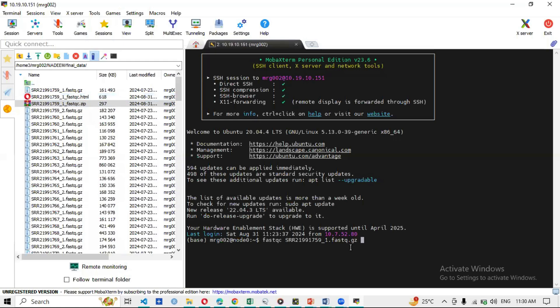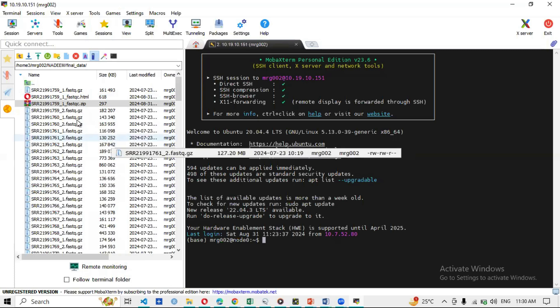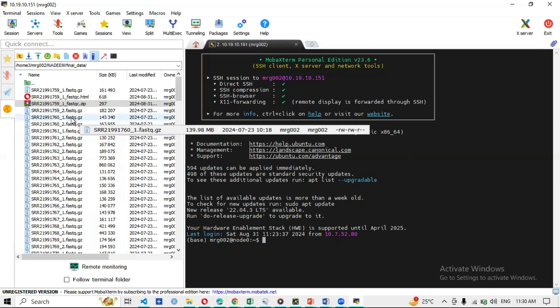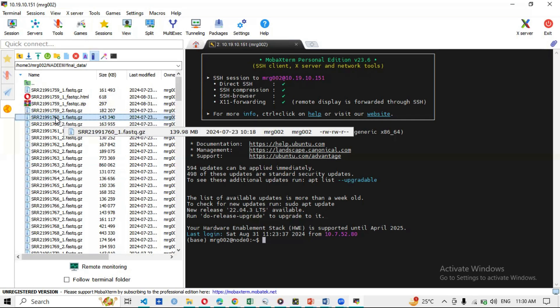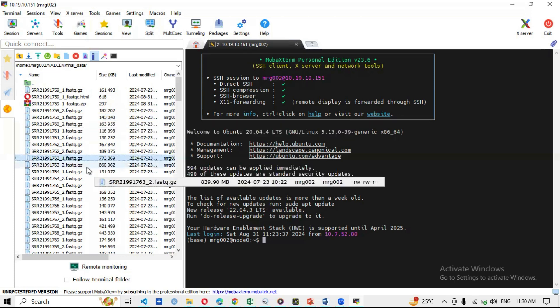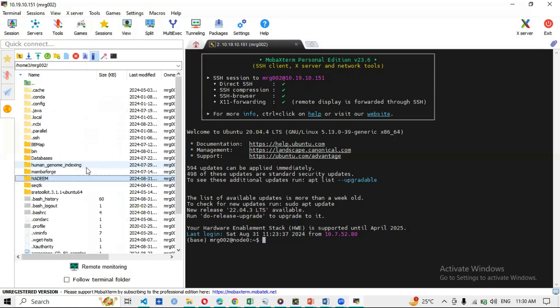Now, if you want to run FastQC on multiple files, it is very easy. You can use a single command or a script — I prefer a script because we will be using scripts extensively in later parts of the series. A script is simply a '.sh' file. Inside it you write your commands, and for multiple files you apply a for loop. To create a script type 'nano fastqc_script.sh'.